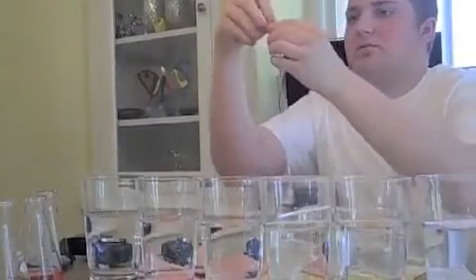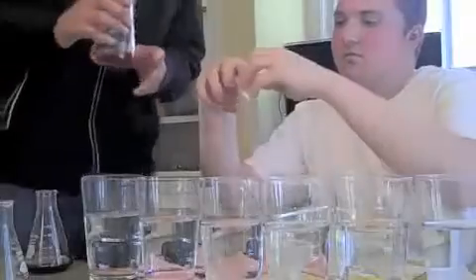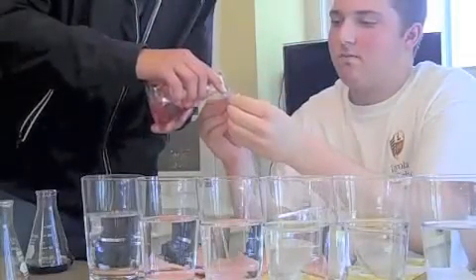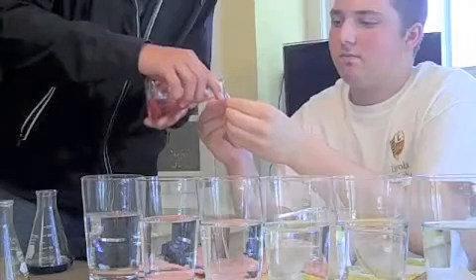Next, we take one piece of tubing and open the opposite end of it. While holding it open, we pour roughly 15 to 20 milliliters of 1 molar sucrose solution in it.